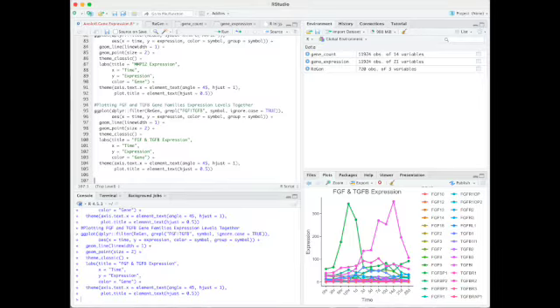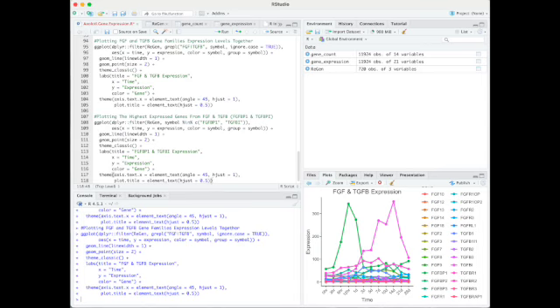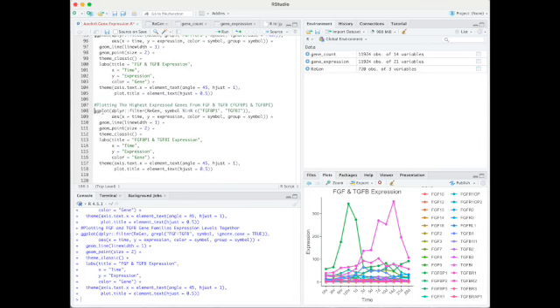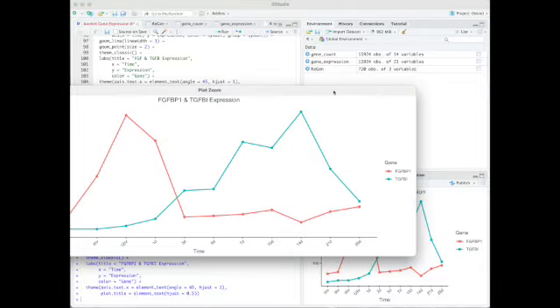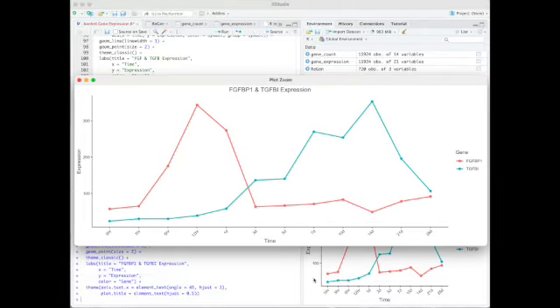To now further examine the expression levels of these genes, we will filter them from regen using the dplyr filter and %in% to identify the genes that we want, and we will then plot with ggplot. This plot allows us to closely examine the two genes of interest.